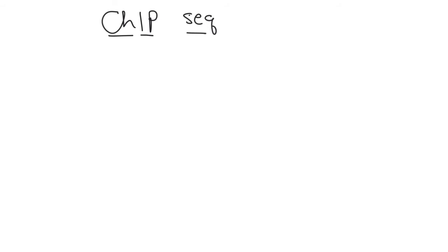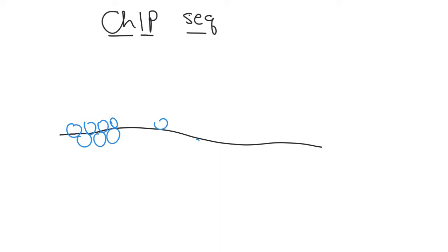The way this works is we look again for places where the DNA is either tightly associated with histones, heterochromatin, or loosely associated, with, again, the idea that loose association will either indicate the position of a transcription start site or an enhancer.